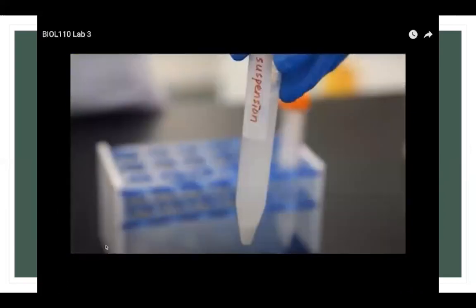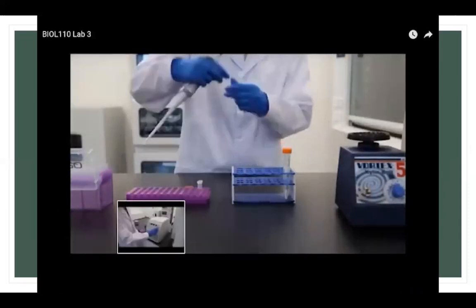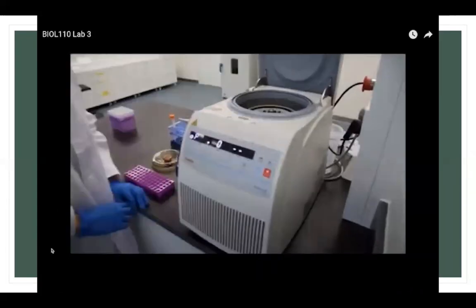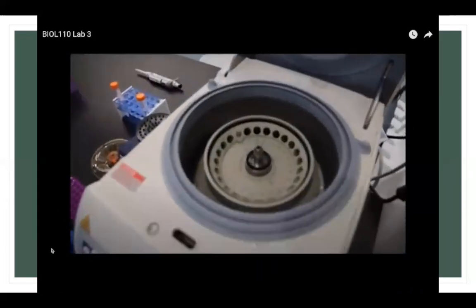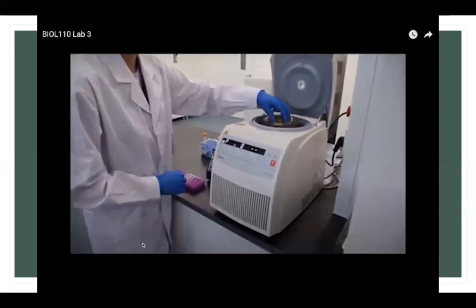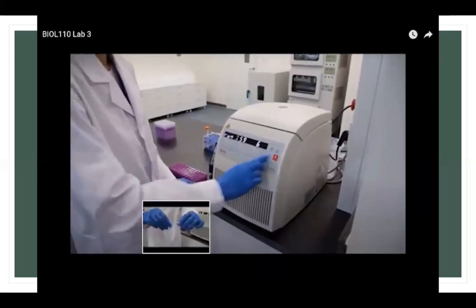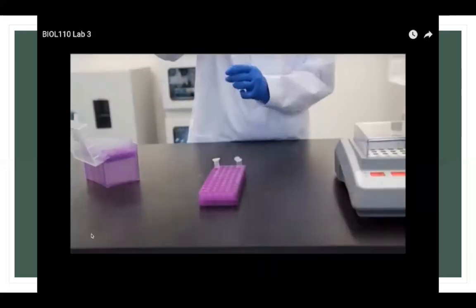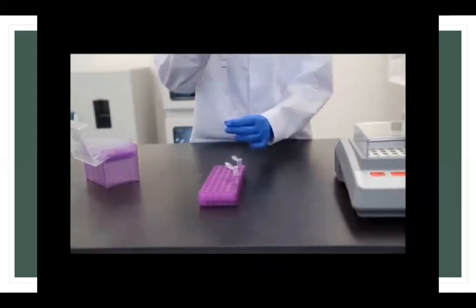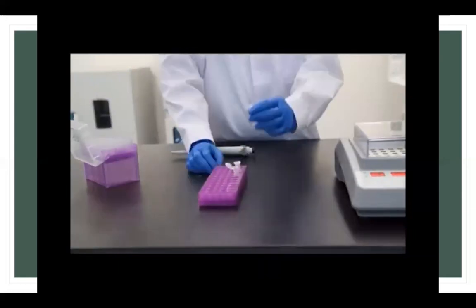Here is the lactase suspension. Pipette 1 milliliter of suspension into 2 tubes respectively and put them into the centrifuge. Set it at 1000 RPM for 1 minute. Pipette 500 microliters of supernatant solution from each tube into another clean tube labeled lactase extract.